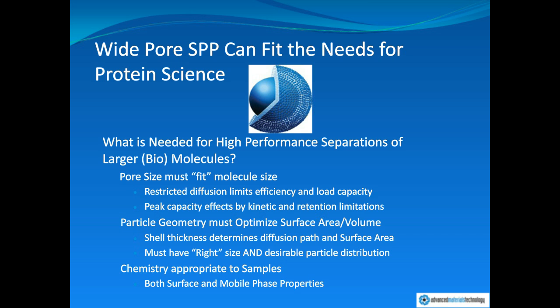So in order to really enable this technology, what do you need to do? Well, you've got to have the right pore size, and I'll show you a number of examples of how that is an inherently true statement. It makes sense because of restricted diffusion, that is the diffusional processes that take your analyte molecule into and out of the porous shell of these particles.